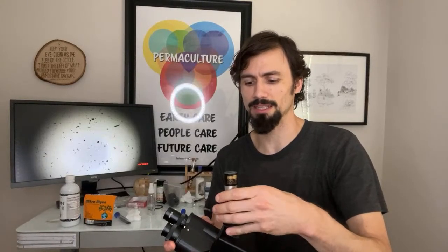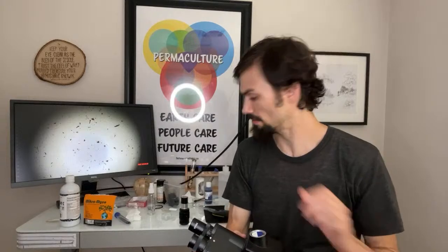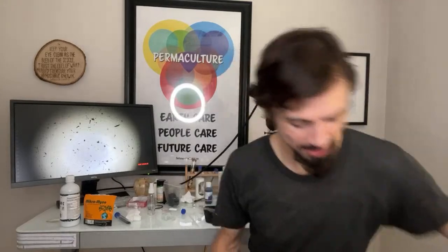I don't wanna ruin it. I'm so afraid of scratching things or messing things up, but I will show you. Do you guys see that lens right there? That little optical lens? That's filtering out all the frequencies below 510. And it's that filter that I'm right now working with a couple different scientists on. See a smudge on it? No! It's okay. Even if it does smudge, I've got the cleaners.